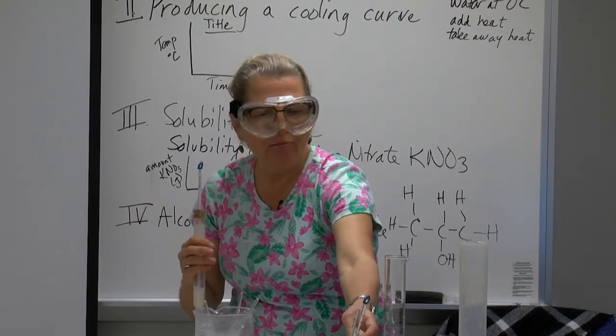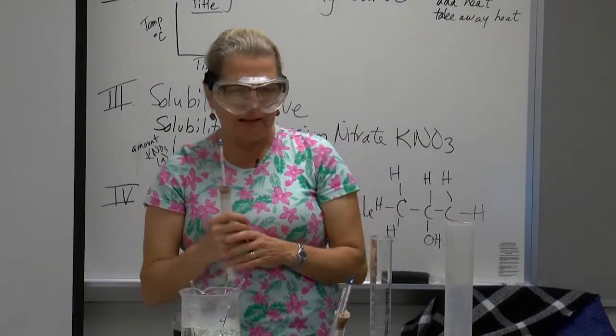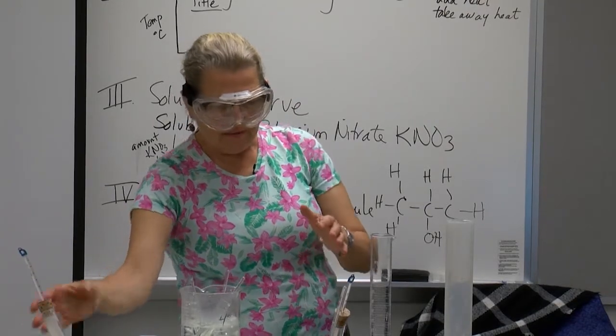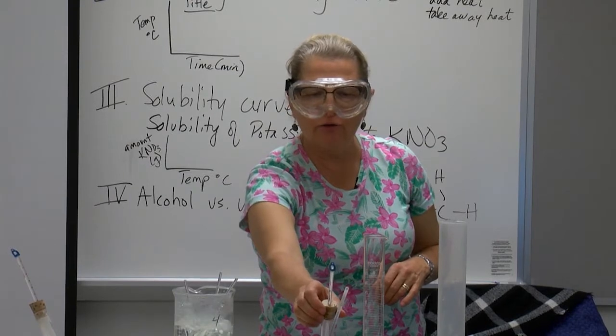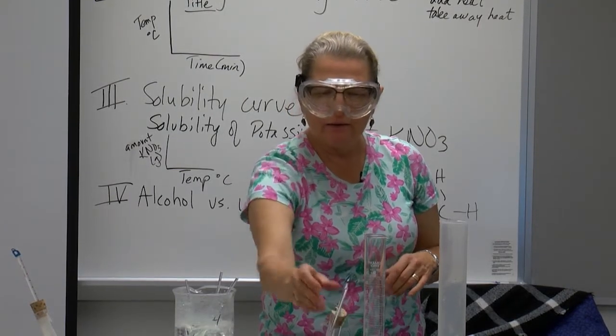I am going to provide the data, but we're going to be looking at this periodically to see if there's any solid forming yet. We started at 100 degrees, now we're down to 98, no solid yet.